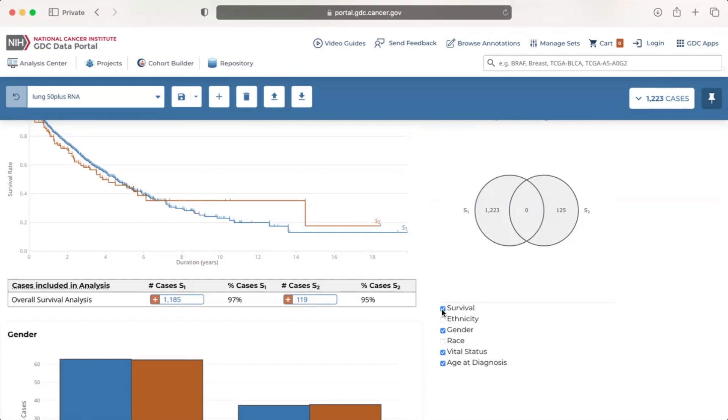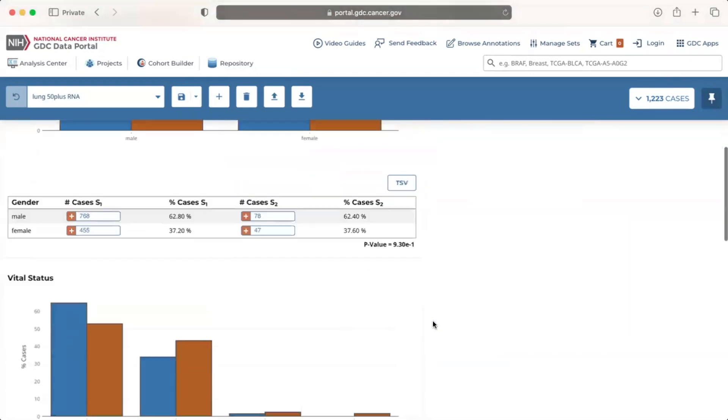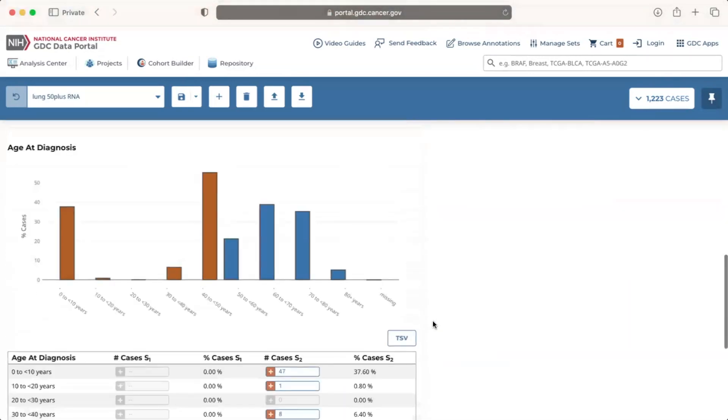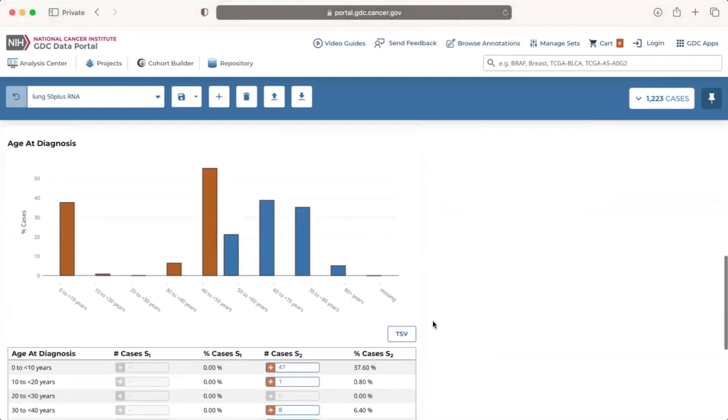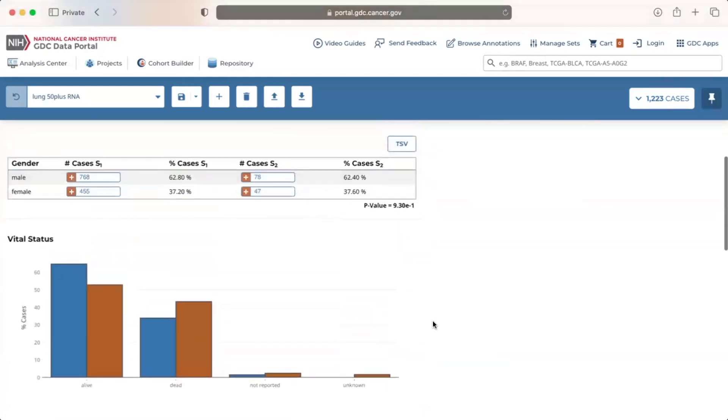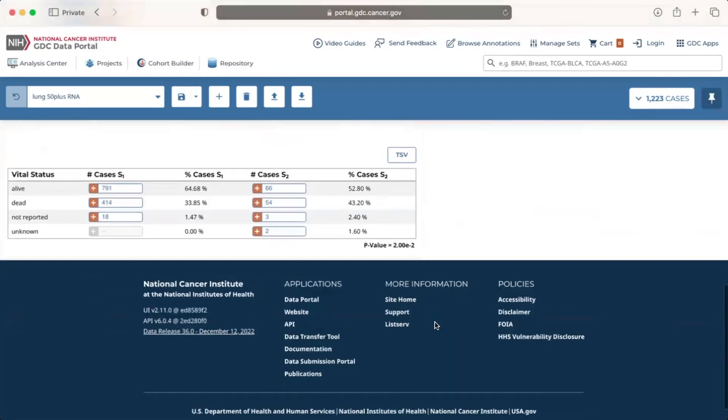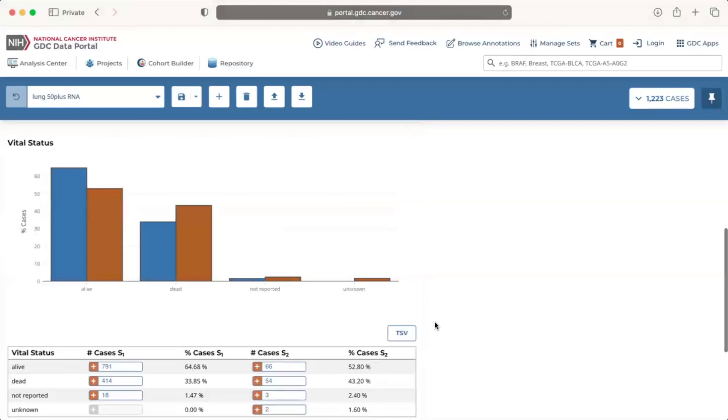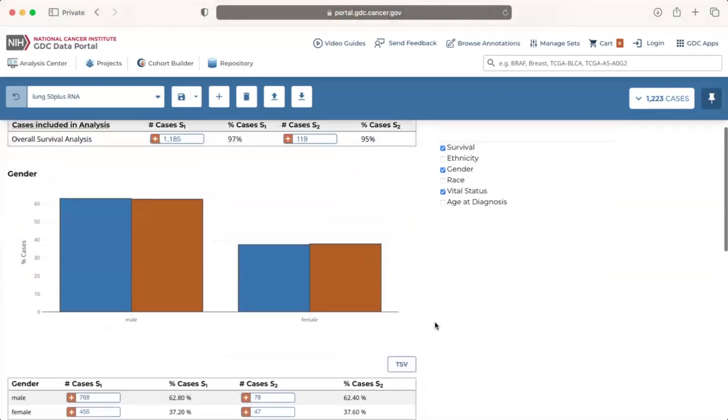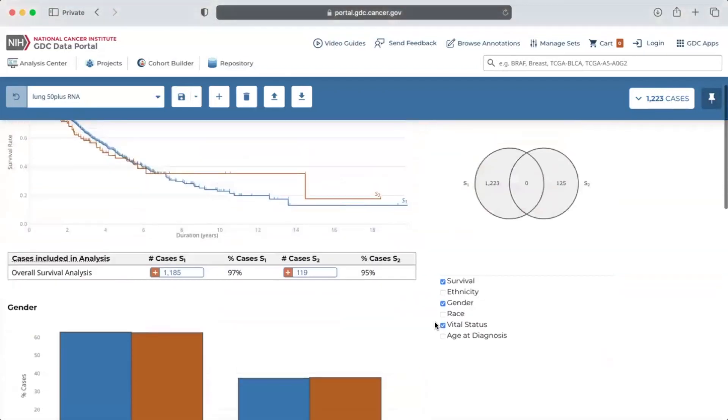The graph for age at diagnosis is interesting because it shows the distribution of age for each of our cohorts. But if we're more interested in comparing between our two cohorts rather than within each cohort, we can remove this clinical facet by unchecking its associated box. We can also add a clinical facet by checking its box. Let's bring back the graph for age at diagnosis.